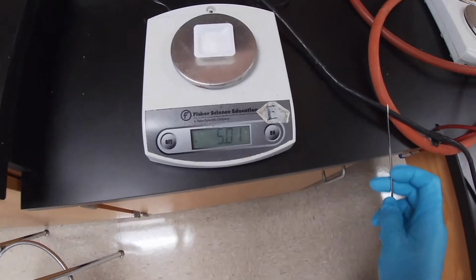And there we go. Here we have approximately 5 grams, 5.01.